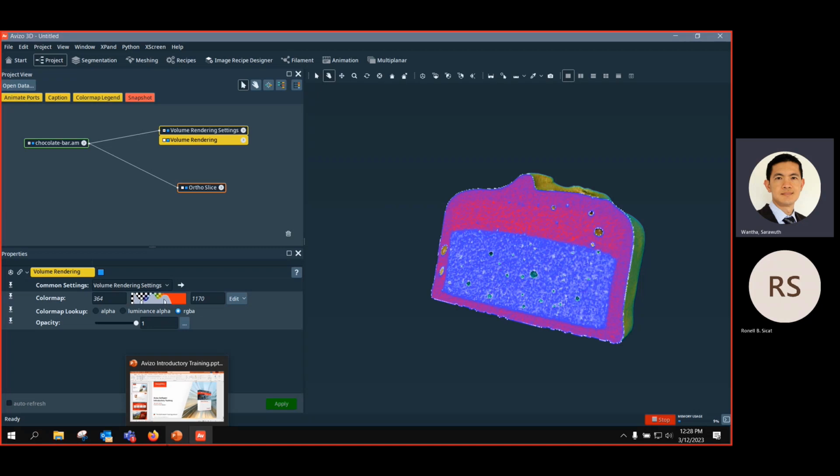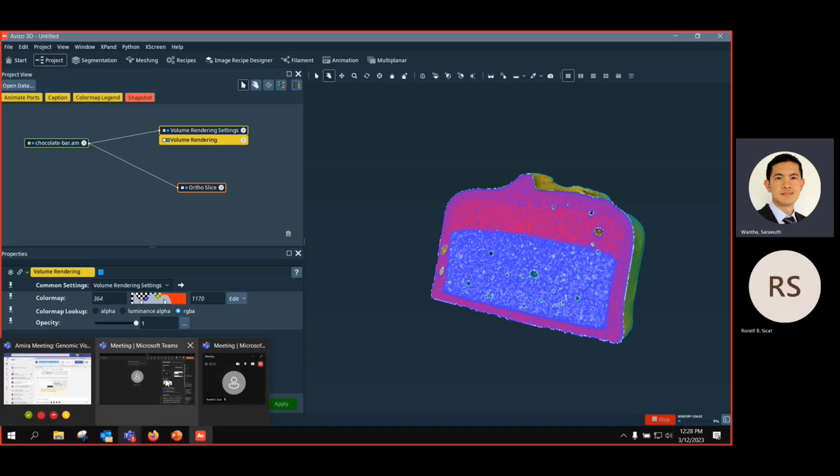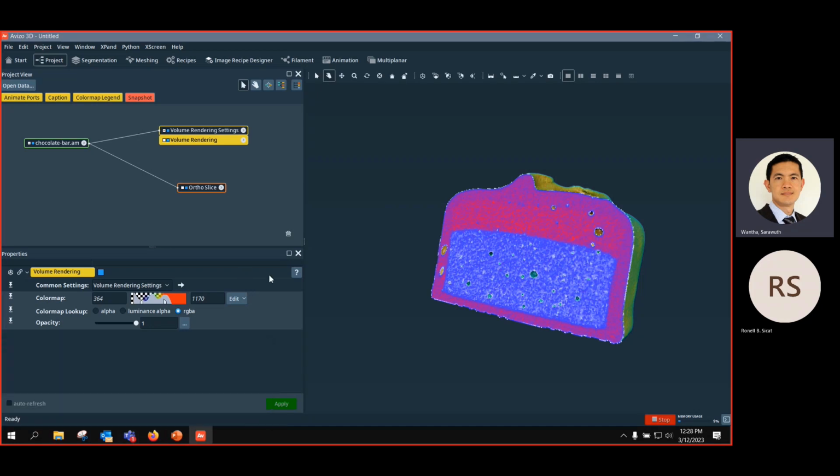Yes, that's just a rule of thumb, but there's more. In general, I would recommend 128 gigabytes of RAM if you can, and the more the better. If you have money, just invest in it.